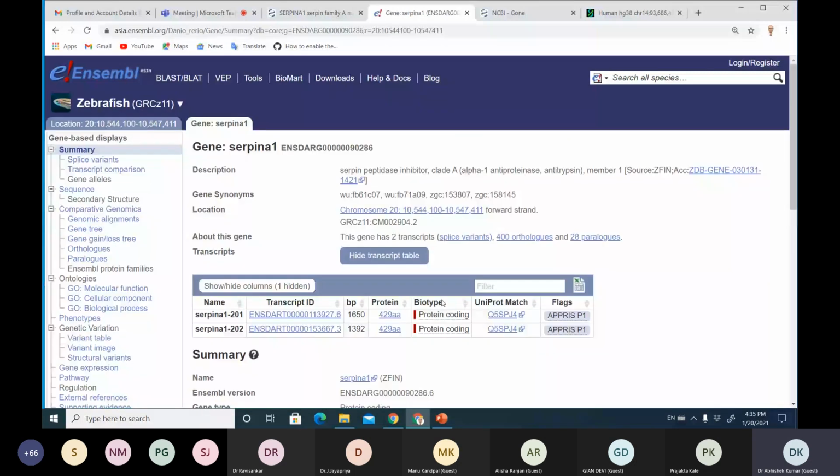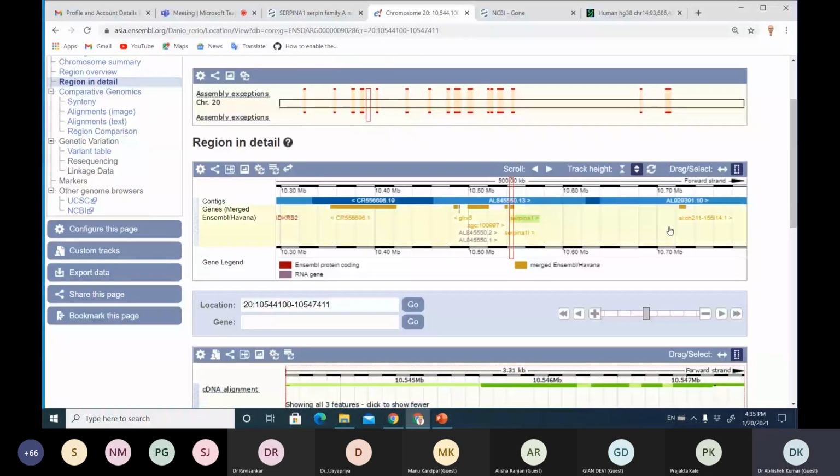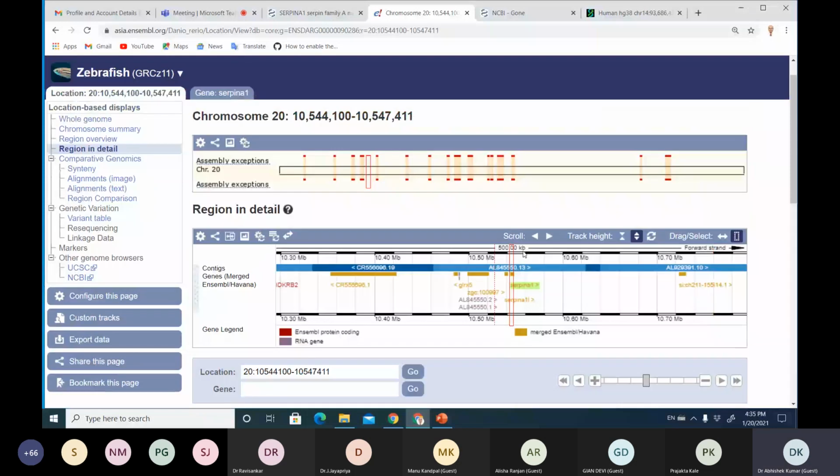And then what you expect this to have, you have already seen in the theory. So we expect 1 or 2 genes in the cluster, and that's what we see here. Okay, so there are only 2 genes in the cluster. Right, so that's what we expected, and that's what is available. So from fish to human, there is expansion, and expansion is even greater in the case of rodents, and that's what we saw.